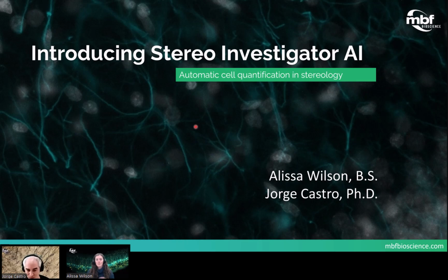As Alyssa mentioned, we are really pleased to introduce to the audience Stereo Investigator AI. During this webinar, we will explain what Stereo Investigator AI is, the advantages of using this software over classic stereology methods, and how the software works in a brief presentation, and then move to an actual demo showing the software, how to set up an experiment, validate results, etc. Finally, we will move to a Q&A segment where the audience can ask questions. And if you want, during the presentation we'll have an open chat, so people can post questions and we will answer those at the end.